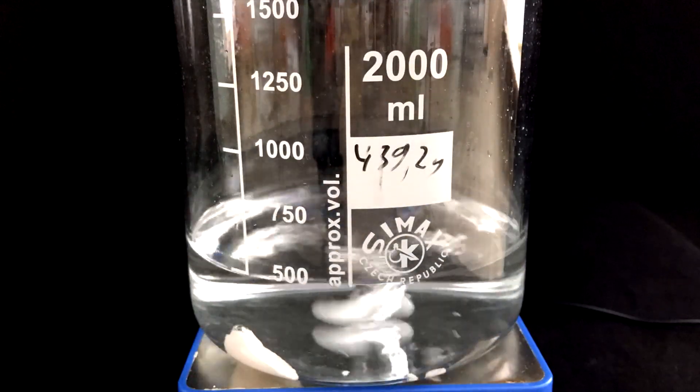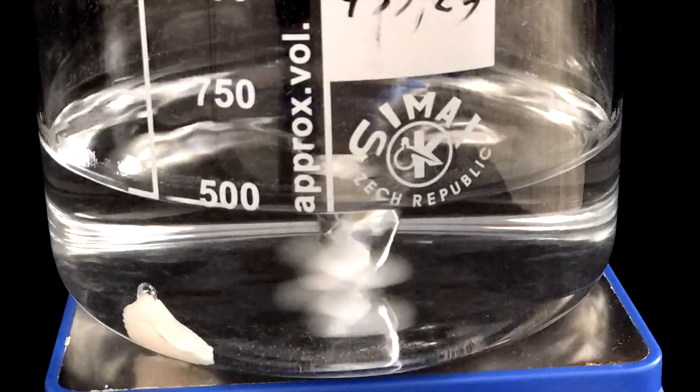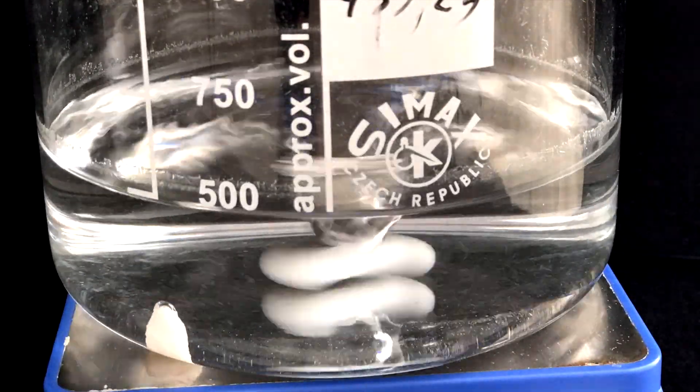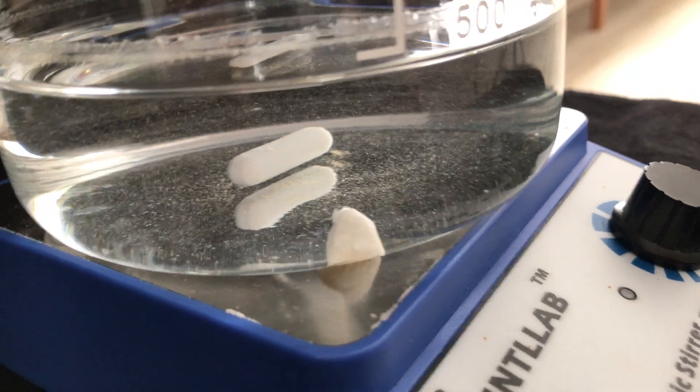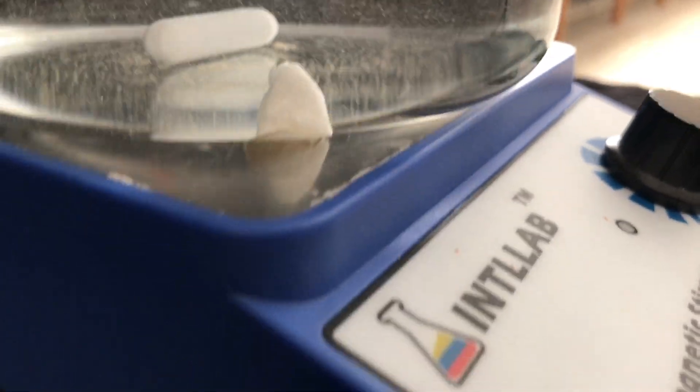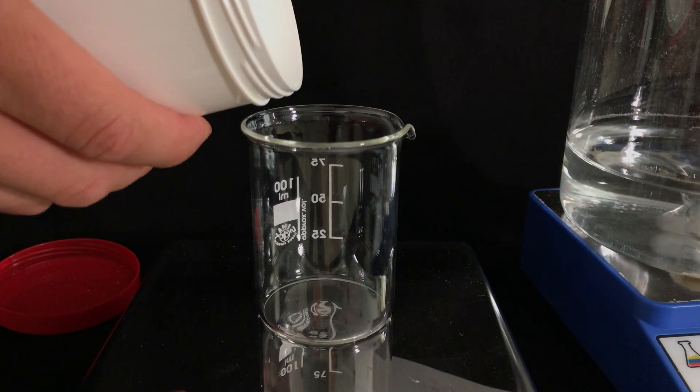If we used the hot plate, we could have dissolved it much faster, but I decided to stick to the magnetic stirrer because I had time. Once fully dissolved, we went to the next step. We have to prepare a solution of ammonium thiocyanate.